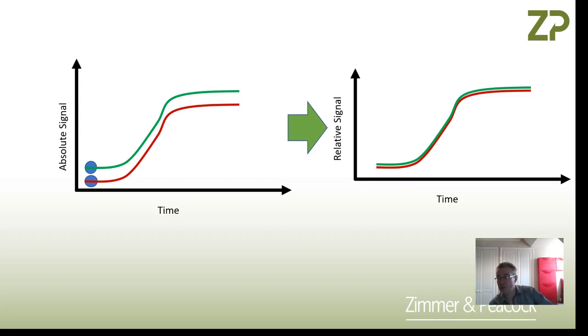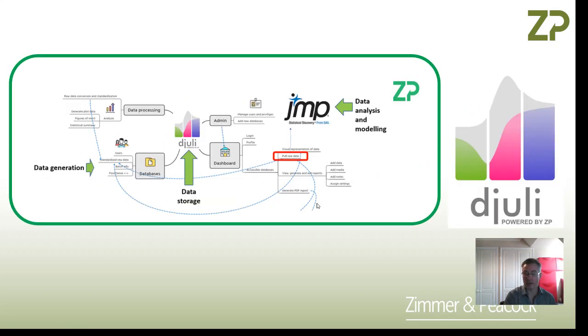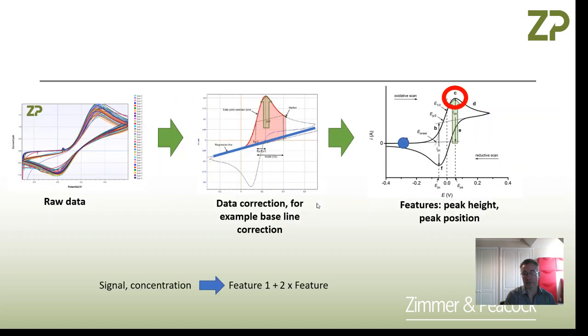That's one of our strategies to get rid of sensor to sensor variability or experiment to experiment variability.